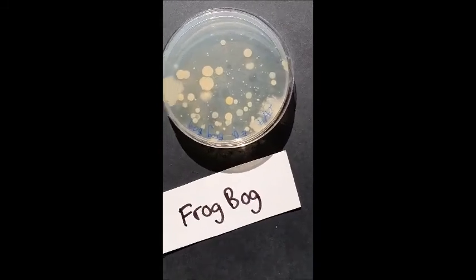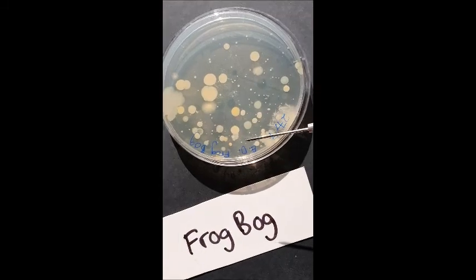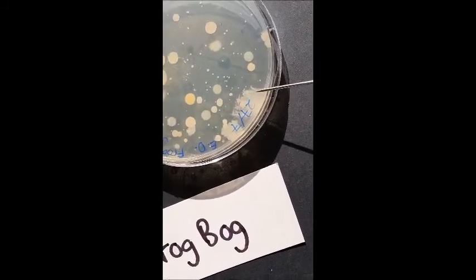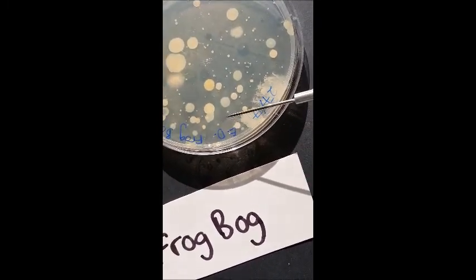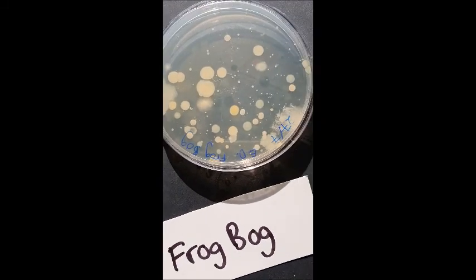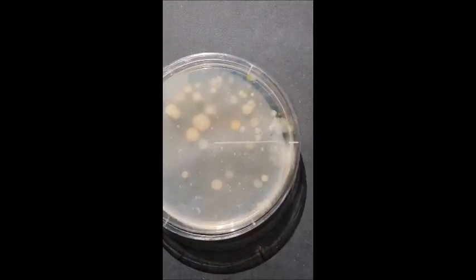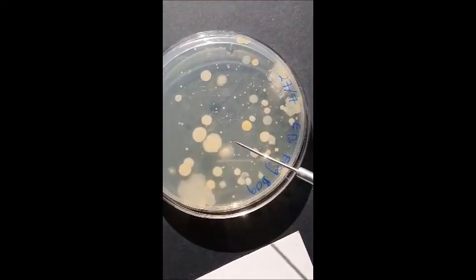I wanted to show you some of the other plates of different locations that other classes did, just so you can get an idea of differences. So check this out. This is the frog bog. Now, you can clearly see there are so many different things going on here. See that? This fibrous business, that looks like a mold or a fungus. And then see all of these blobby kind of things are bacteria. They're shiny. You can see that on the other side. Oh, it's a bit, no, it's condensation-y. Very shiny. I think we have a few different types here.